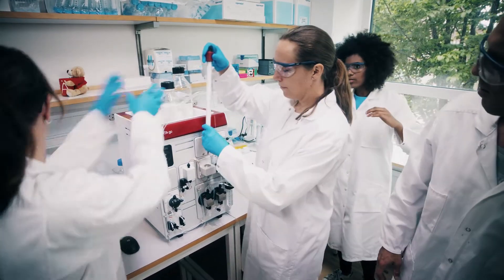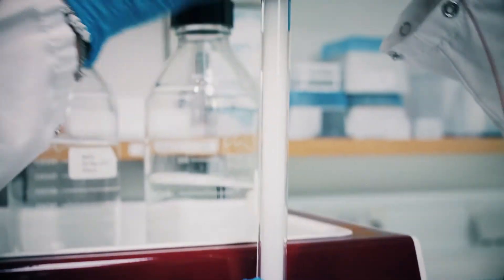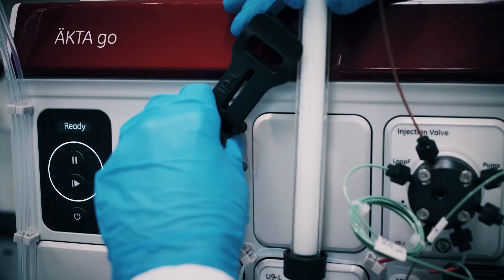It's a very compact chromatography system that will handle all your routine purification. It supports techniques like affinity, ion exchange, and size exclusion chromatography.